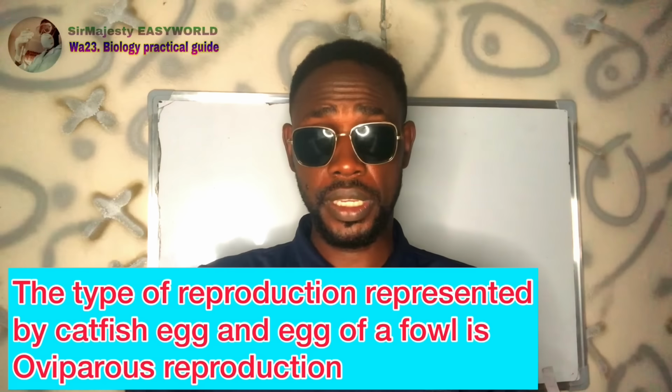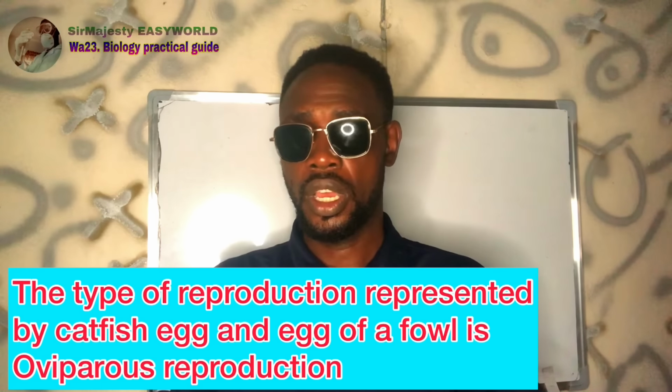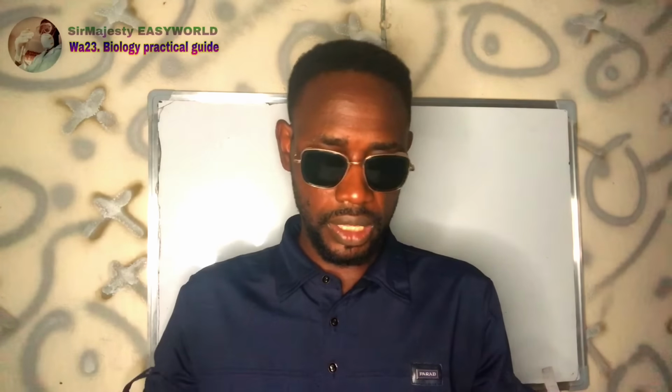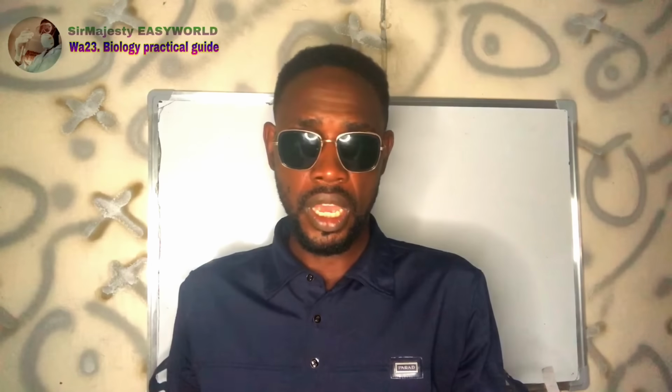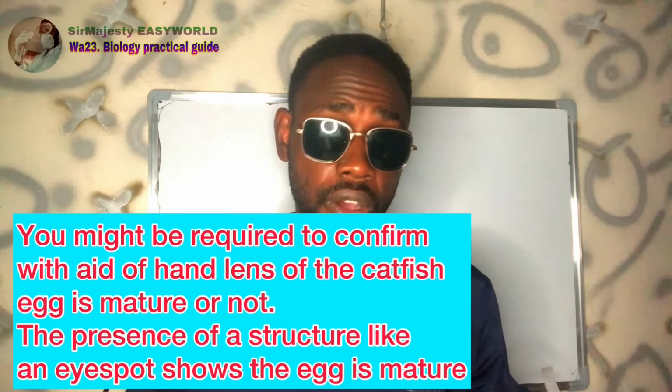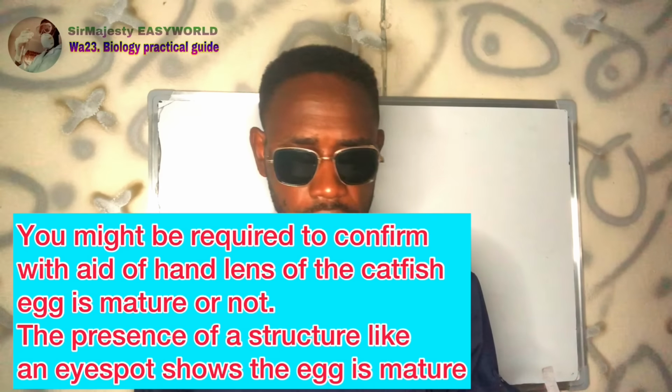So presence of a thick shell in the domestic fowl, absence of a thick shell in that of the catfish, or you can say a thin chorion membrane is present in catfish. That one is absent in the domestic fowl. But both of them exist at the cellular level of organization, provided they are not fertilized. They didn't tell us whether they are fertilized or not, but an unfertilized egg, no matter how big it is, is just a cell. Therefore, the biggest and the largest cell we have is the cell of the unfertilized egg of an ostrich. That is the Struthio camelus egg.